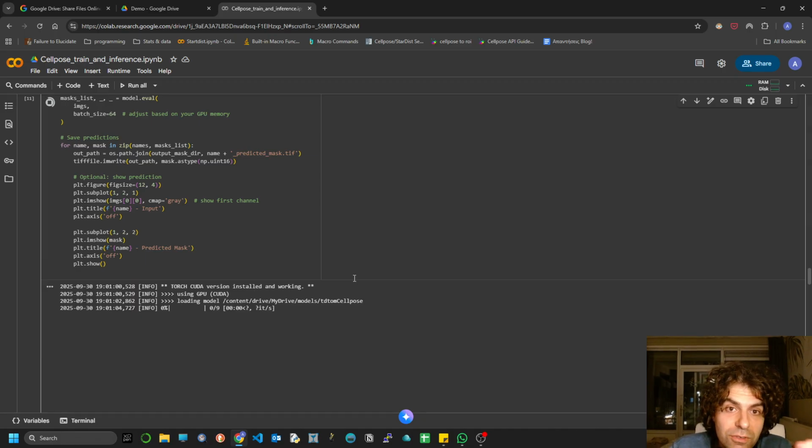That would make it, of course, around 10 minutes for 10 planes. So I have something between 15, let's say, and 20 minutes for 10 planes. I have 9. So I'm going to pause this video, and then I'm coming back with the results that we have and the conversion of the masks to ROIs.